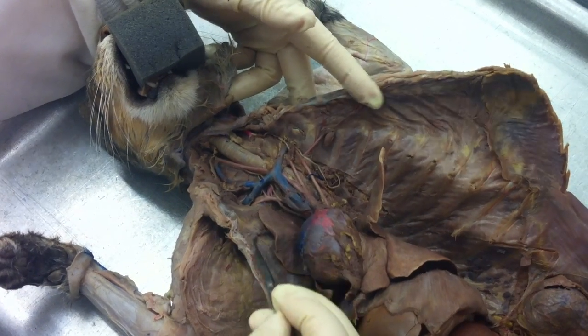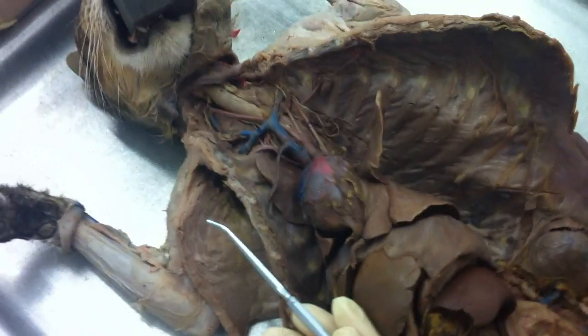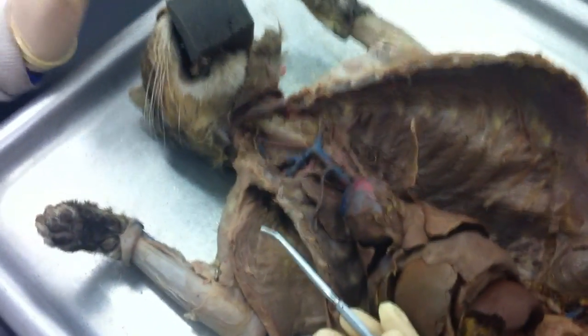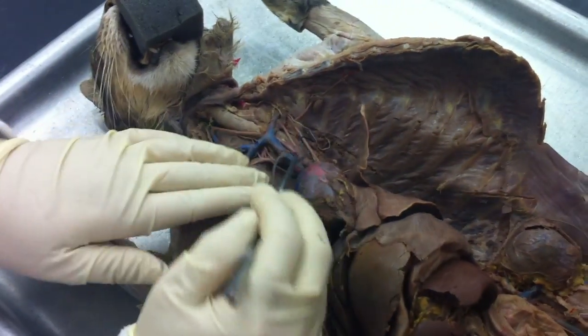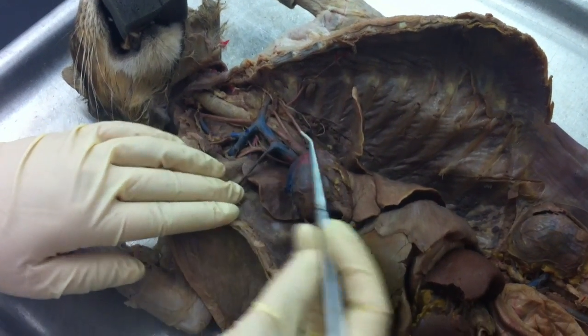We'll have to do left and right also? Yeah. Put left and right on everything you possibly can. Obviously, if we ask you to ID the stomach, there's no left and right stomach, so that wouldn't make any sense. But if there's a left and a right, put left and right. So here's the left subclavian.